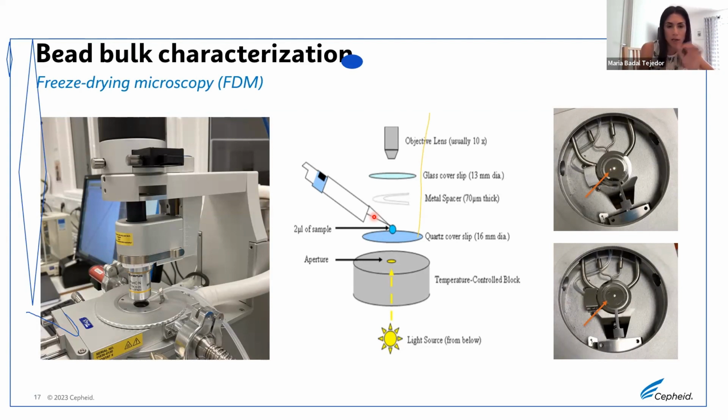So the droplet is placed between 2 glass slides. Those glass slides are placed on a stage that will freeze and cool down the solution, and heat it up later, and then vacuum is applied inside the chamber. We follow the behavior of this droplet with the camera.